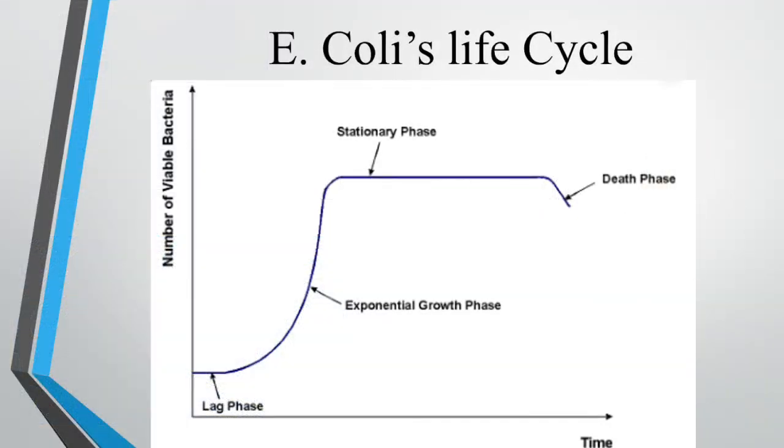As with any type of living organism, E. coli has a life cycle. They initially start in the lag phase in which no cells are being produced because the cells are still adapting to the conditions of the reactor. The next phase, or exponential phase, is when there is the largest amount of cell reproduction. This is due to the consumption of the substrate, M9, which allows for optimal growth and reproduction. The third phase is called the stationary phase, and this halts the increase in the number of cells. The cells will eventually run out of space or nutrients and stop dividing. Lastly, since there are no more nutrients to feed the cells, they enter the final phase, or death phase. The cells begin to die and their population decreases.